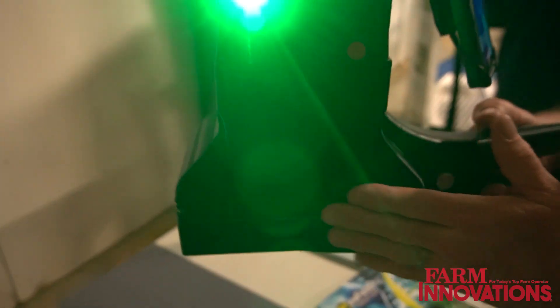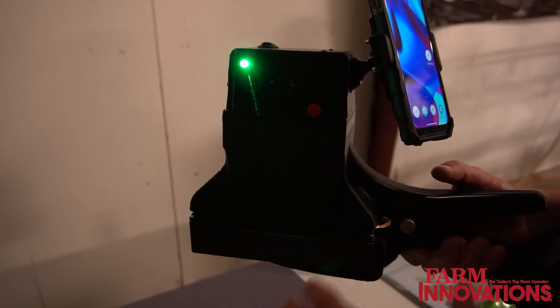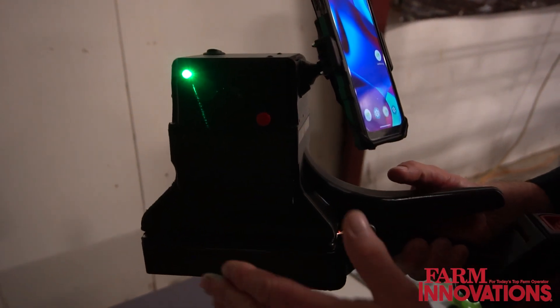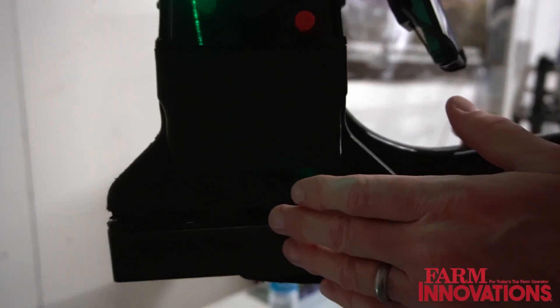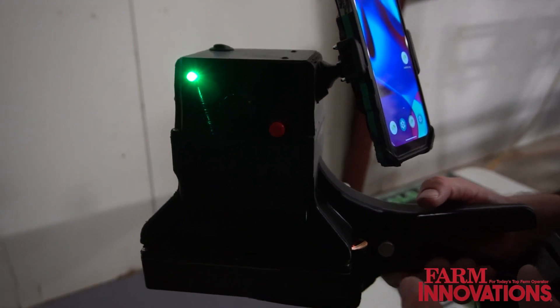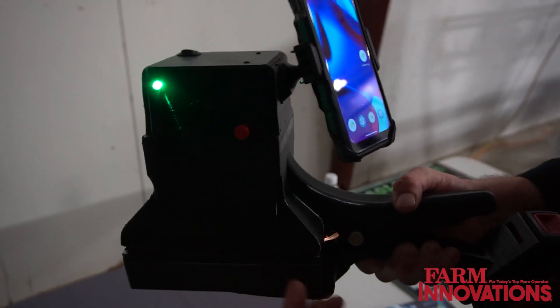The reason we have gone with this design is that imagery is very sensitive to ambient light, angle of the sun, and time of day. What we've done is design this so that we can place the leaf in here and eliminate all environmental conditions other than what we want to measure, giving us a consistent and accurate measure of the nutrient profile. That is why we've gone with this type of design.